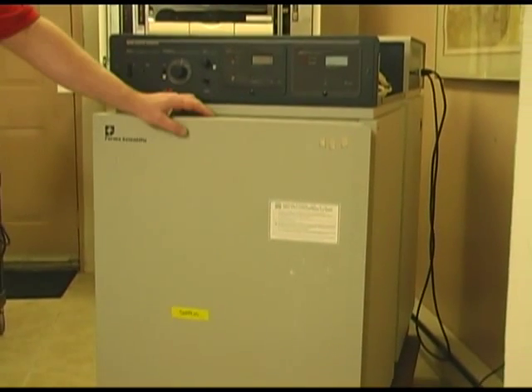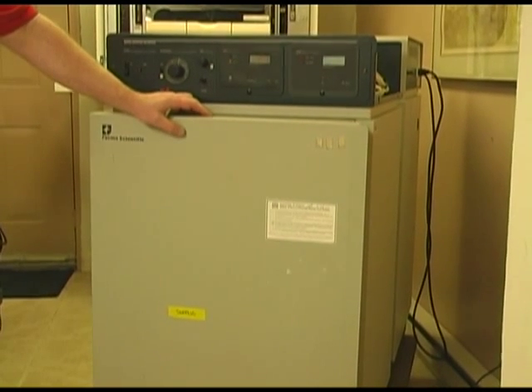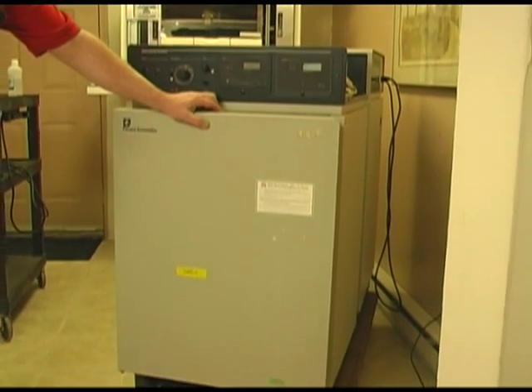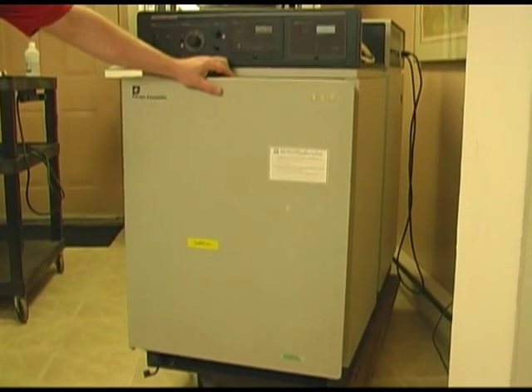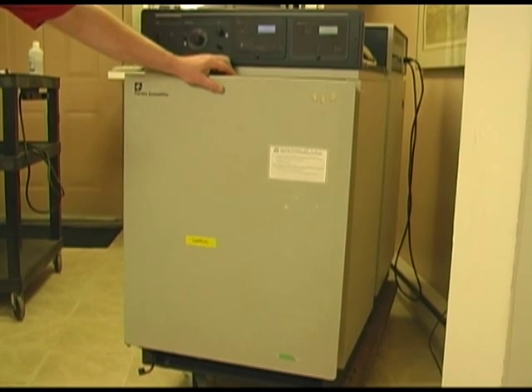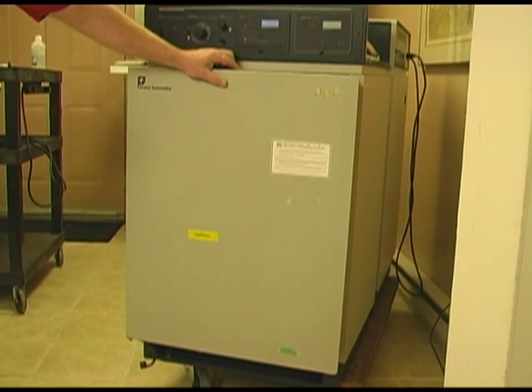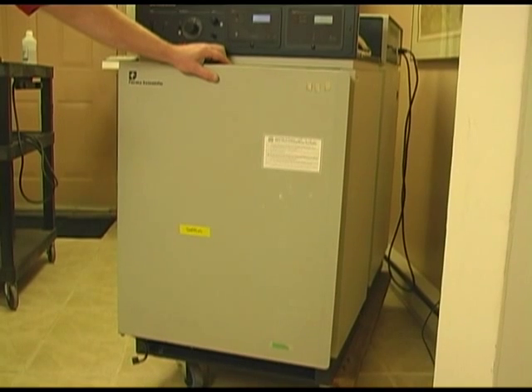First things — all incubators have one thing in common: they all have chambers. Those chambers can be heated in two ways: air or a water jacket. The advantage to air is that it is quick to get to the set point, for example 37 degrees, whereas a water jacket incubator would take 24 hours to get to that temperature.